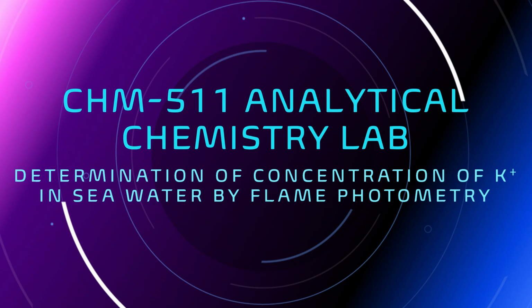Hello everyone, I am Dr. Mohammad Saad, and in this slide we will be discussing the determination of concentration of potassium in seawater by flame photometry using the standard addition method.